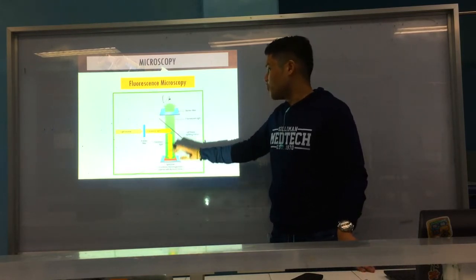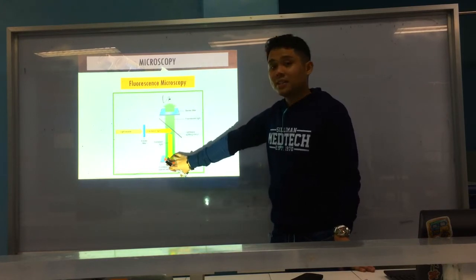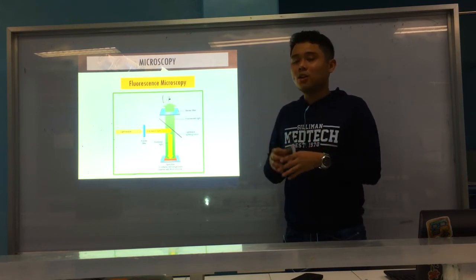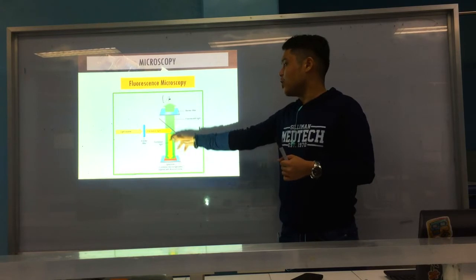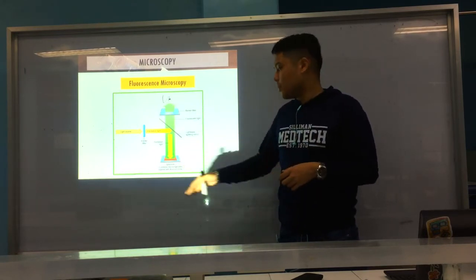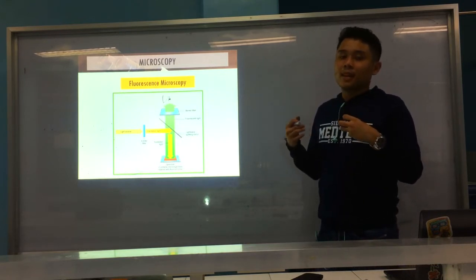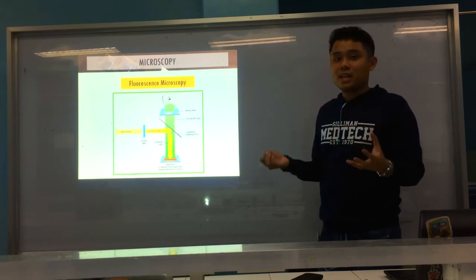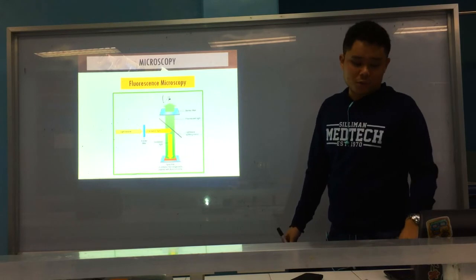And then a light wave splitting mirror directs the light to the specimen, where the dye is. The dye will absorb the light, and after absorbing it, it releases the light back. That is now the light that we see, the light emitted from the fluorochrome, or the dye that absorbs the light and then releases it back. When it releases the light, that is where it glows, and that is what you see in your fluorescence microscope, okay?